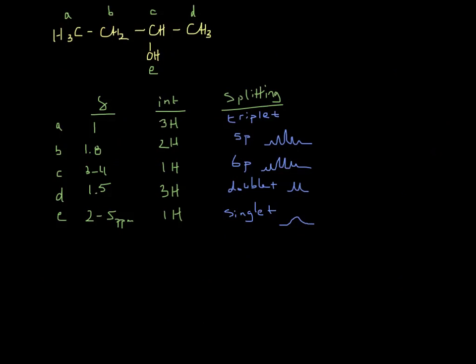All right, I'm going to go into one more kind of complex splitting in a second, but I would like you guys to try one more molecule, and we will talk about this one in class. So see if you can figure out what all of the multiplicity looks like on this one. And that's the one that we'll go through first.